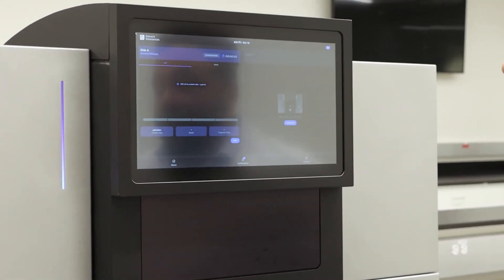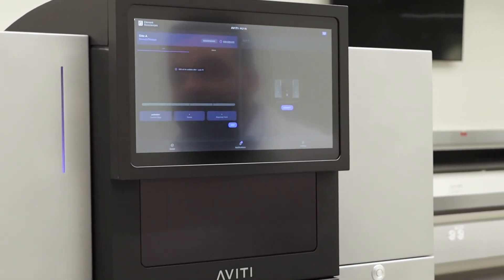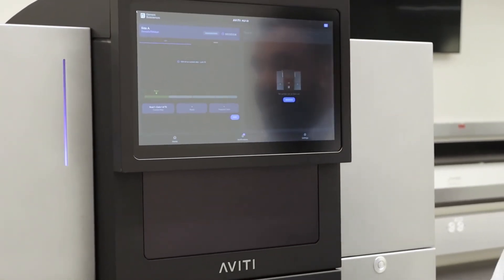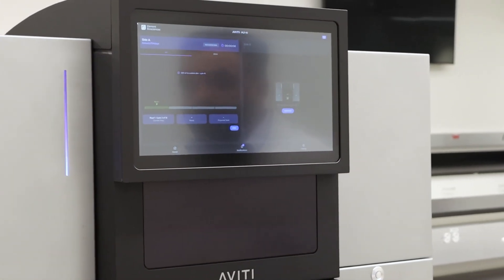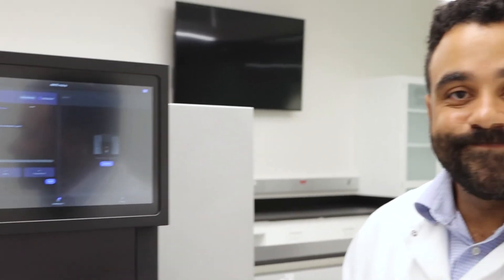And then the sequencing will begin and take roughly 24 to 48 hours, depending on your run. Thank you.